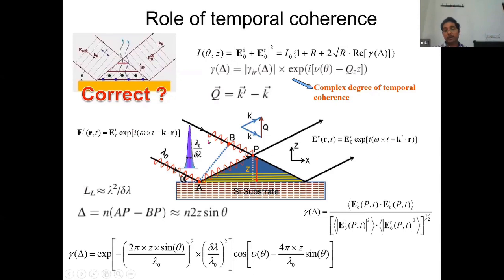So, the technical things. Again, there may be some people here from a chemistry background also. But anyway, if you accurately want to determine the nature of the existing field in this triangular region, then you have to consider the monochromaticity of the incident wave field. It is very important.